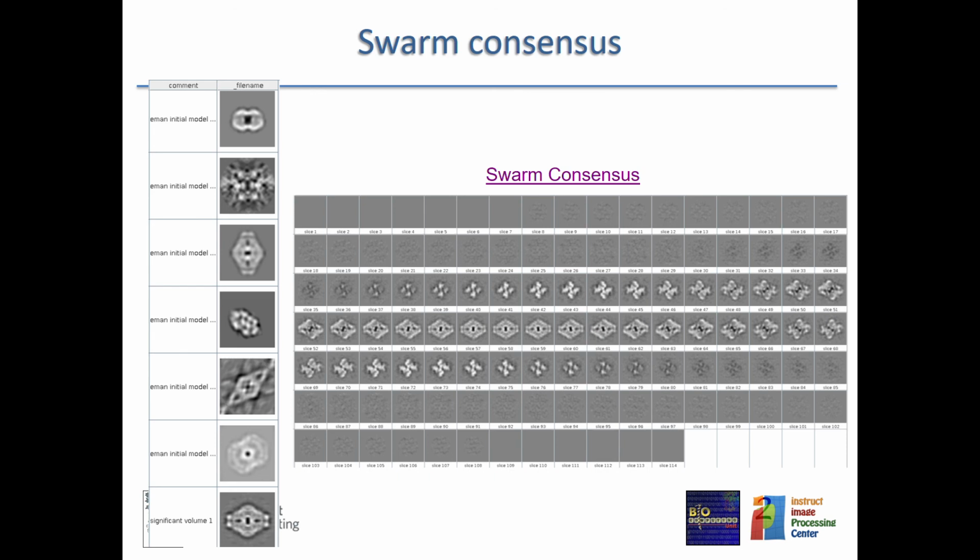And normally, or most of the times, it is the global maximum. So maybe it is not a very high resolution, especially because to speed up the process and also to reduce the amount of local minima, we work with very low resolution images. But the overall shape is normally good to start an initial volume, to start a standard optimization and refinement process.